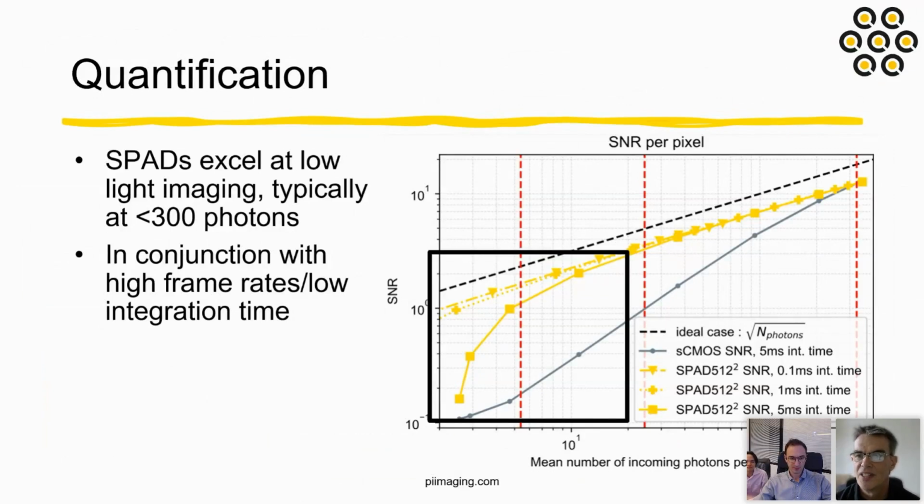Thank you. So a question about ICCDs. How do SPADs compare in terms of quantum efficiency with ICCDs, where you can tune the process to get very high values from UV through the IR? EMCCDs have quantum efficiency north of 80%.